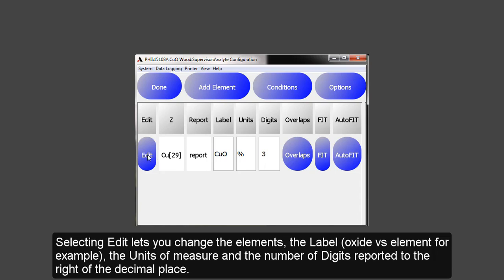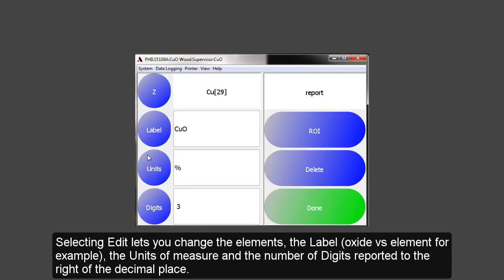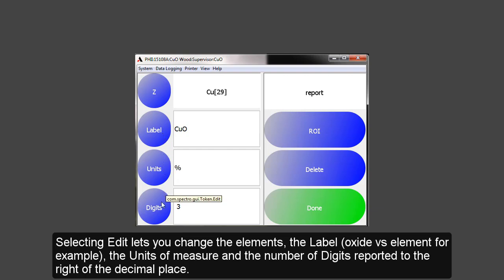Selecting Edit lets you change the elements, the label of oxide versus element, for example, the units of measure, and the number of digits reported to the right of the decimal place.